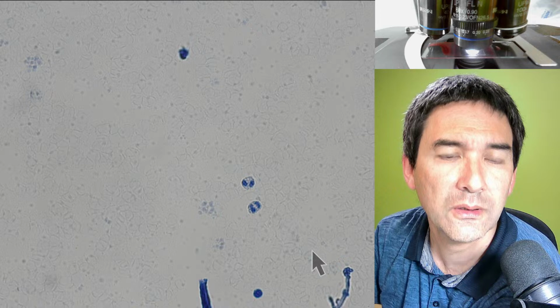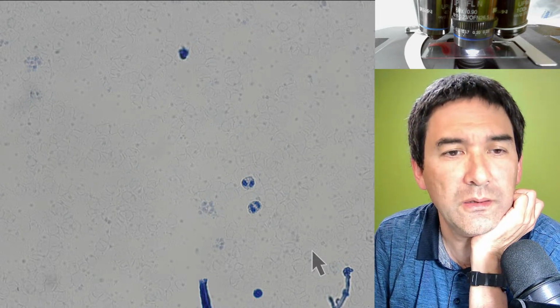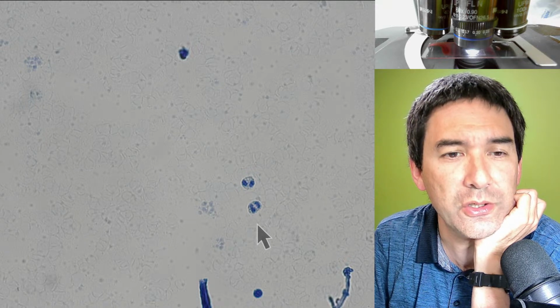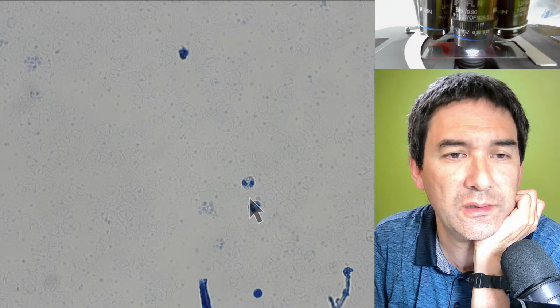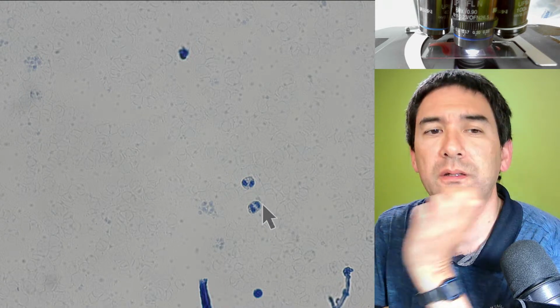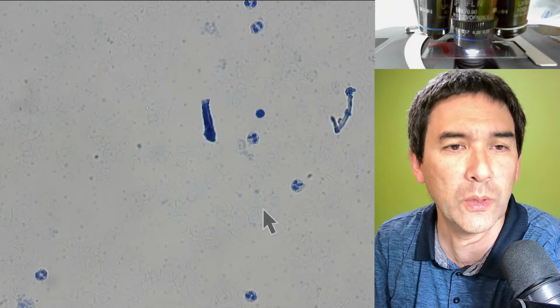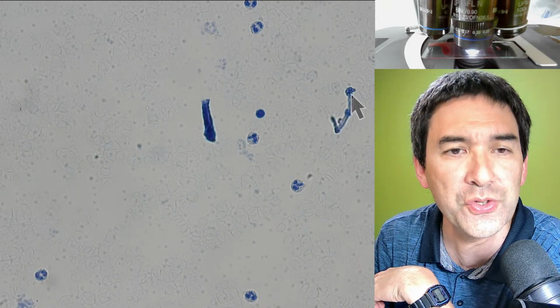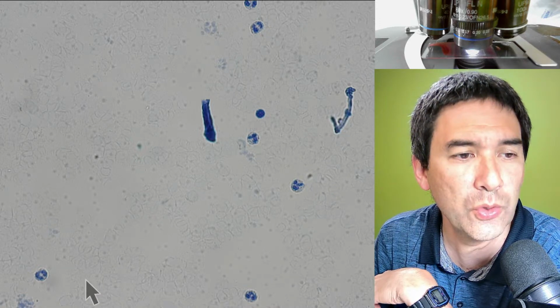Look. I think we can agree, now the red blood cells are not visible at all, but the white blood cells are. Oh, it looks interesting. Look, it almost looks like it's dividing. So this basically seems to work quite well. Those irregular things that you see in here, forget about those. And I think this even works better now.